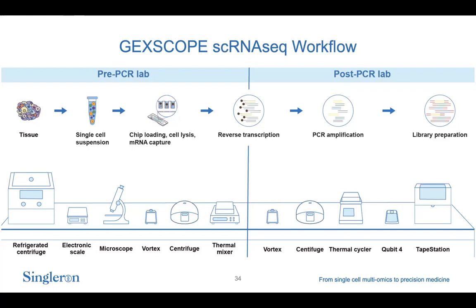And this is why we recommend to have the pre-PCR workstation and the post-PCR workstation in separate labs. And you should also have your dedicated lab coat and basically all the instruments and consumables dedicated either to the pre-PCR or the post-PCR lab, and do not mix things between these two workstations.